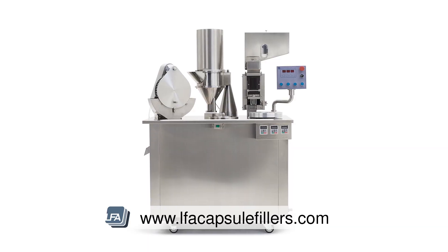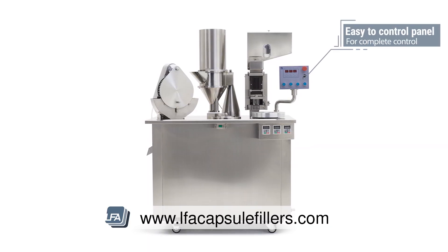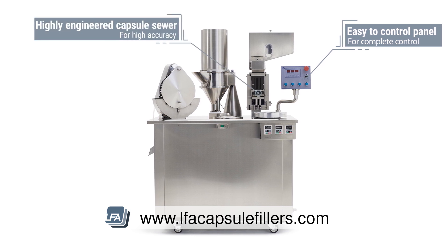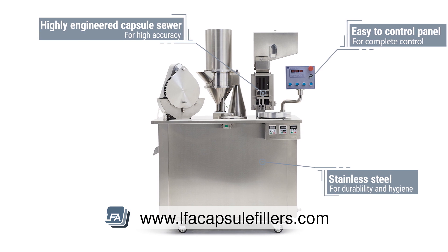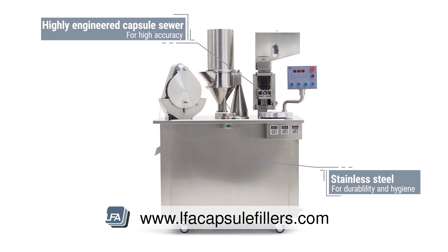The SACF25 features a simple and easy-to-use control panel, a highly engineered sew-in section that allows for high accuracy, stainless steel construction for durability and hygiene. Parts are easy to disassemble to allow for easy cleaning.